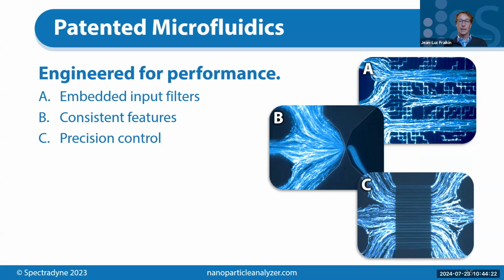And then it looks like last question, or two more questions. Can you permeabilize EVs, much like cells, to allow antibody entry? That's a good question. And if you have ideas for or working protocols for that, Stanley, we'd love to hear from you about that. So shoot us an email and we can talk about doing some sample measurements or something to answer that question. That would be a really cool experiment. So reach out to us, please, about that.